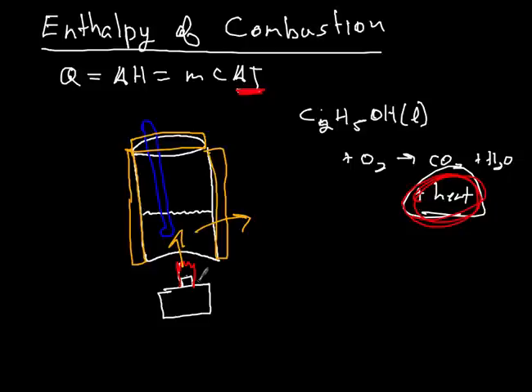And so how you set this up physically, how am I going to get a can over this container of ethanol? And we've got spirit burners. They're just like little tabletop lanterns, if you will. How you suspend the can over it, that's up to you. It's how you want to figure it out. But this is the basic premise of the experiment.